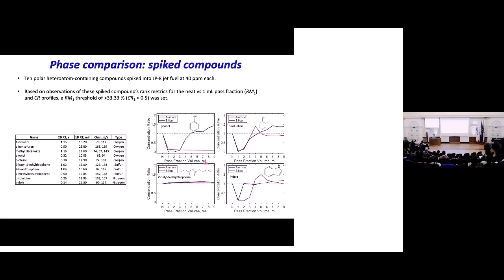compounds from the input of fuel that have higher affinity, and so all the high affinity compounds will start pushing off the compounds that have lower affinity. And we see this effect as the breakthrough throughout time, throughout the extraction procedure.